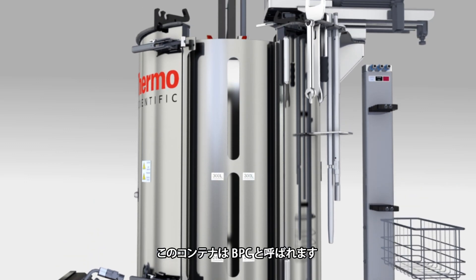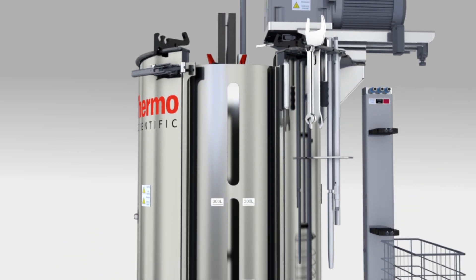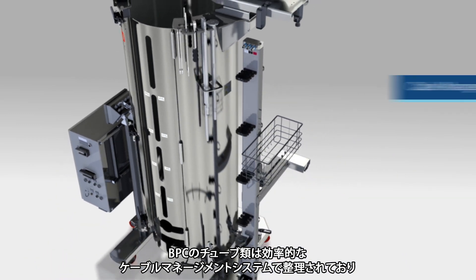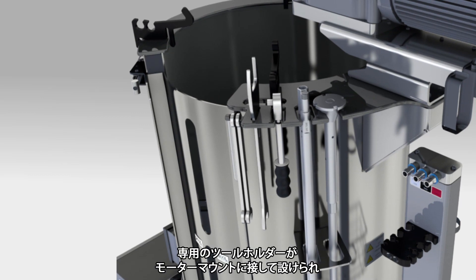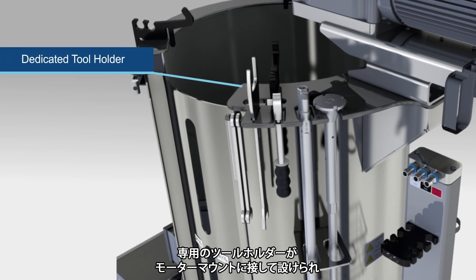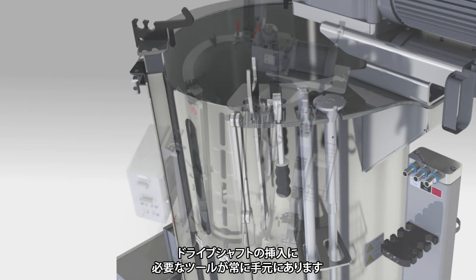This container is also known as the BPC. An efficient cable management system organizes BPC tubing to help reduce clutter. A dedicated tool holder is positioned next to the motor mount to keep required tools accessible for drive shaft insertion.